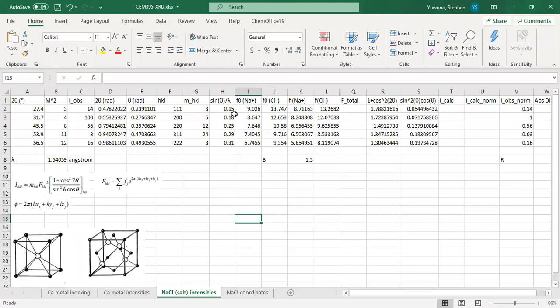Right. So now, if you're at this point, I would assume that from the metal sample calculations, you know how to set up all the calculations from 2 theta, converting the units, getting the HKL indices and their multiplicity, and then obtaining the temperature independent scattering factor, or F0.